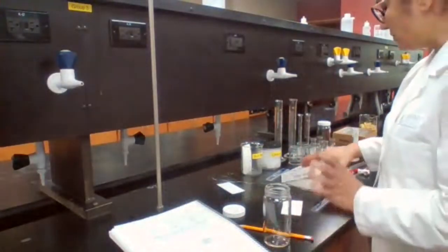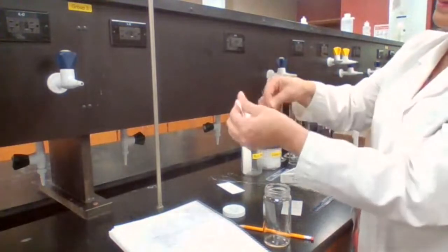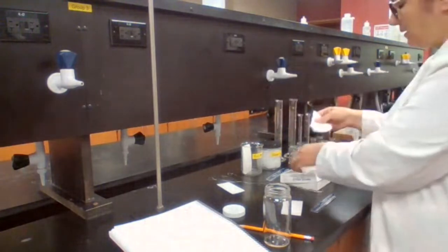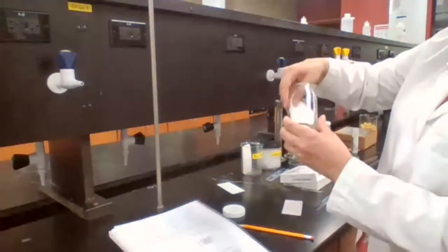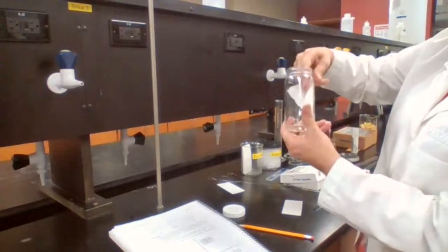And I'm going to use a piece of filter paper, and place it inside the developing chamber. The purpose of using this paper is not for chromatography, because you've done paper chromatography for biology lab most likely.